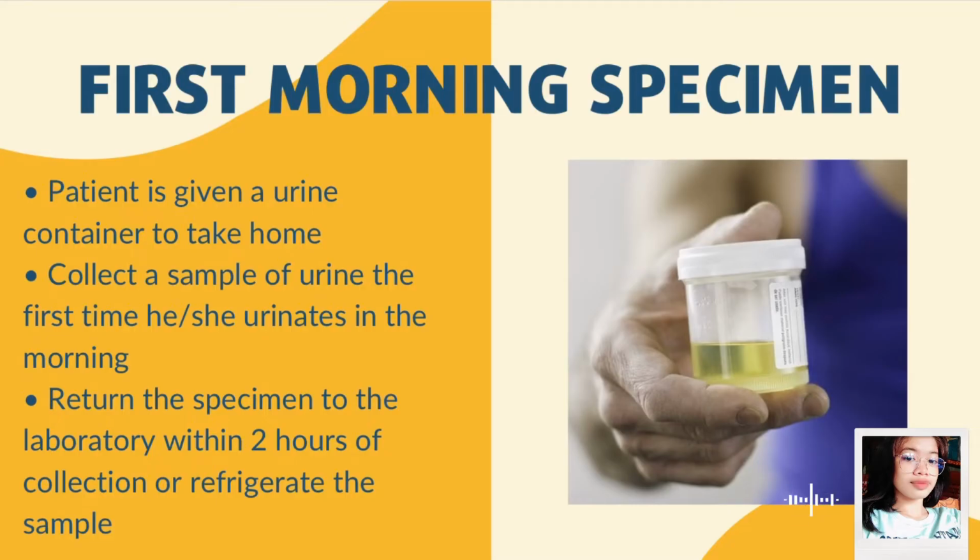And lastly, return the specimen to the laboratory within 2 hours of collection or refrigerate. The patient must deliver the container with the entire specimen to the lab as soon as possible. If you expect a delay, refrigerate the specimen to retard growth of bacteria that could affect test results. The specimen should, however, be delivered to the lab within 2 hours.